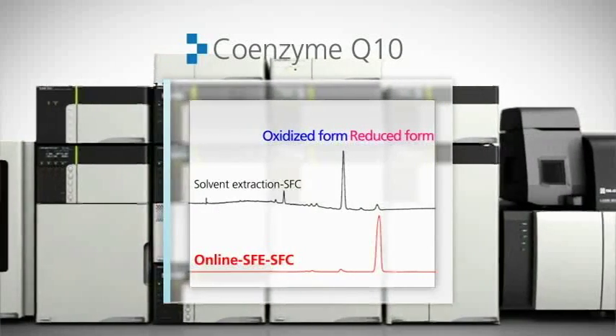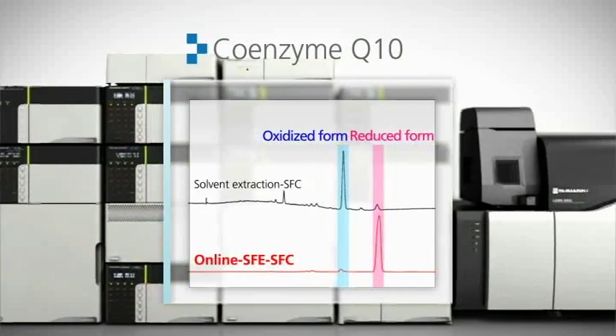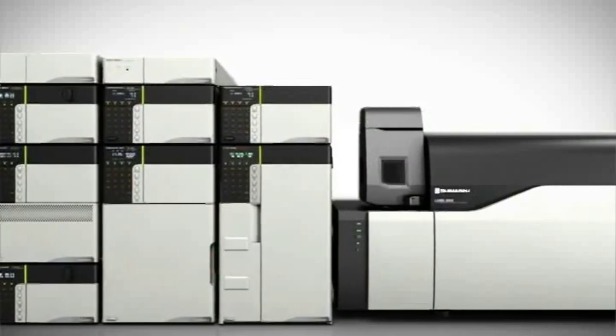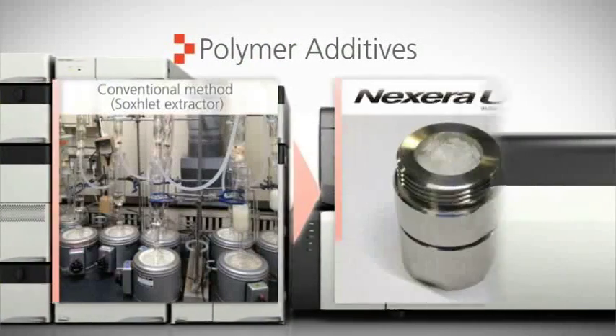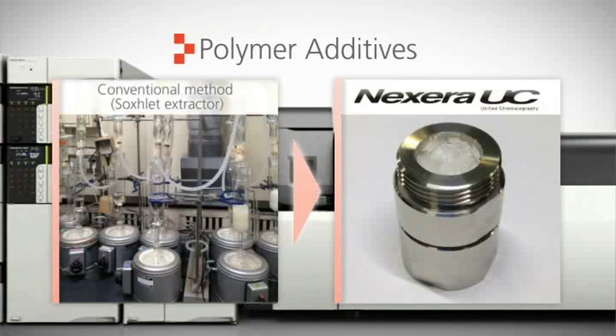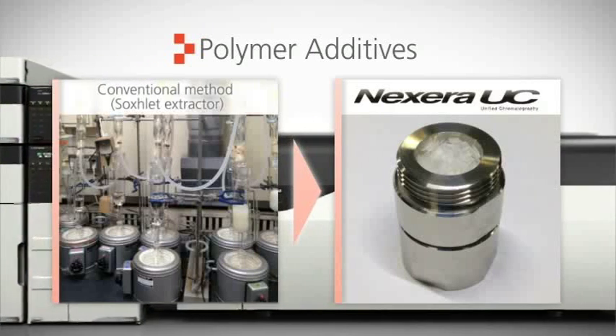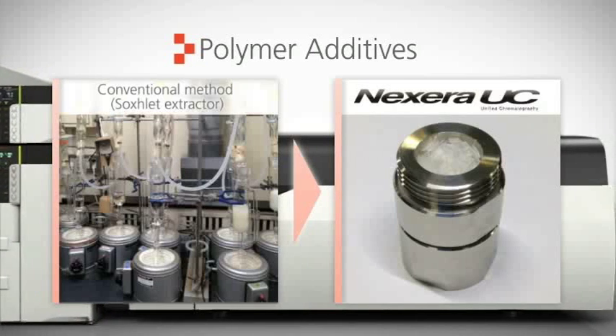Supercritical extraction of labile compounds, like the reduced form of coenzyme Q10, prevents oxidation that occurs with common sample preparation techniques. Conventional methods using Soxhlet extraction for analyses of polymer additives can now be done by simply loading comminuted samples into the extraction vessel.